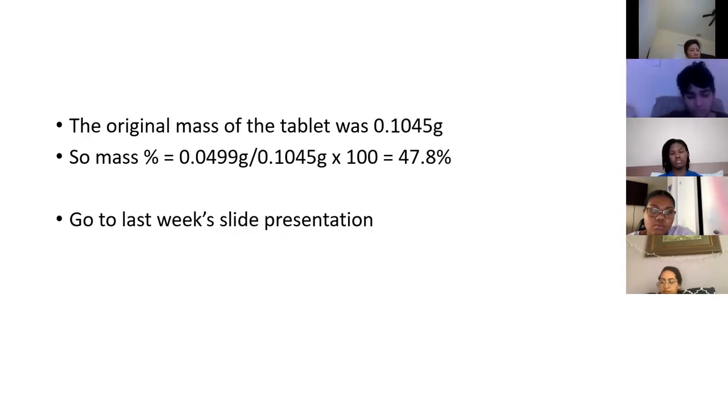The extra slides that I have on here have to do with back titration that I went over last on Tuesday. It is part of the PowerPoint. It tells you how to account for the extra HCl that's added.